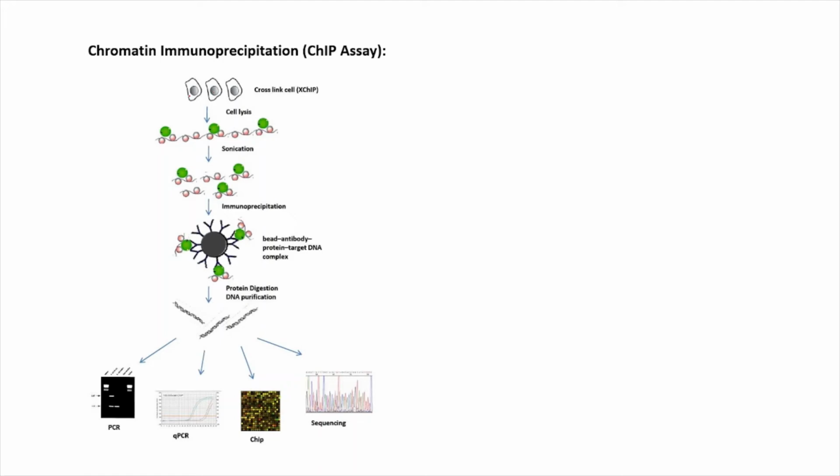So today we are going to discuss chromatin immunoprecipitation. Now this topic is important for GATE, IIT JAM, CSIR NET, DBT-JRF and all the national level competitive exams on biotechnology. So chromatin immunoprecipitation is often acronymed as ChIP assay.